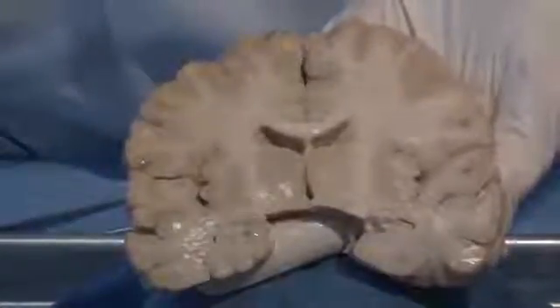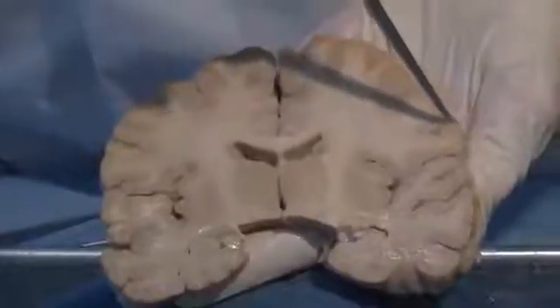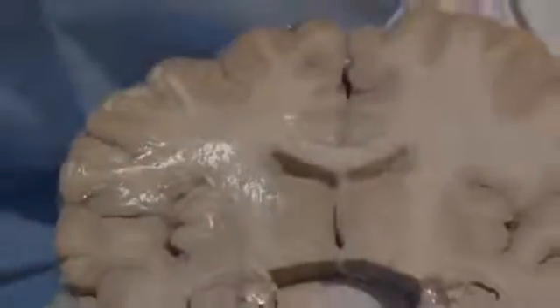And I'm going to rest it here so that you can see the internal structure of the brain. We'll deal with these in more detail, but right now you can see that those gyri that we were looking at and the sulci, the dips in between, can be easily distinguished. And the gyri are covered with a nice layer, beige in color, and that is your gray matter, as we say, of the cerebral cortex. Maybe we should have called it beige matter. And beneath it is a lighter area, which we call the white matter. In general, gray matter consists of cell bodies, both neurons and glia, and white matter are axons.